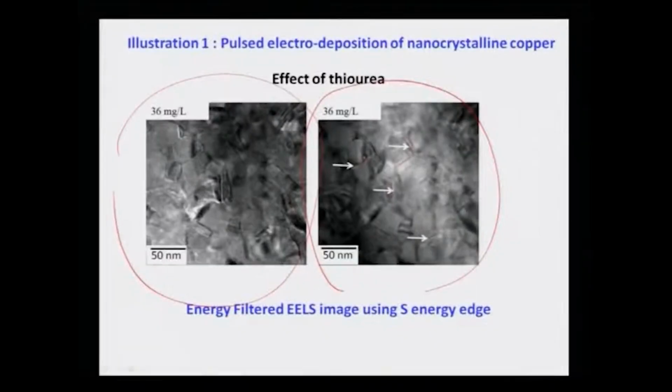The microscope which I showed you in our campus does not have this EELS, but I have shown you how the EELS can be attached at the bottom of the microscope just below the camera. It can be attached, and the signal can be processed using a computer.